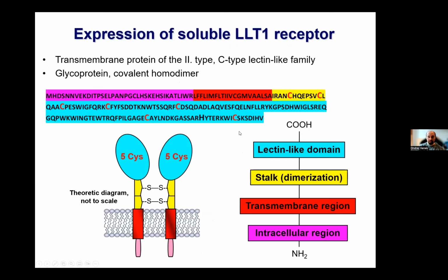So when we wanted to study these two proteins, so the structure and the complex, we needed to produce them in a soluble form. So naturally, both proteins are transmembrane. LLT1 has intracellular region, transmembrane, and extracellular domain.